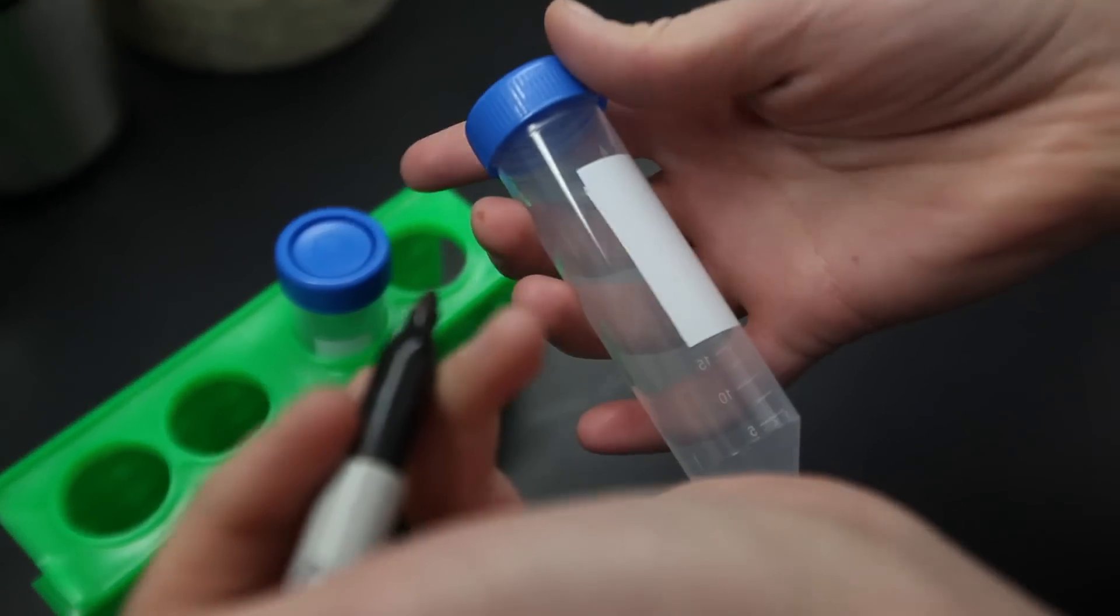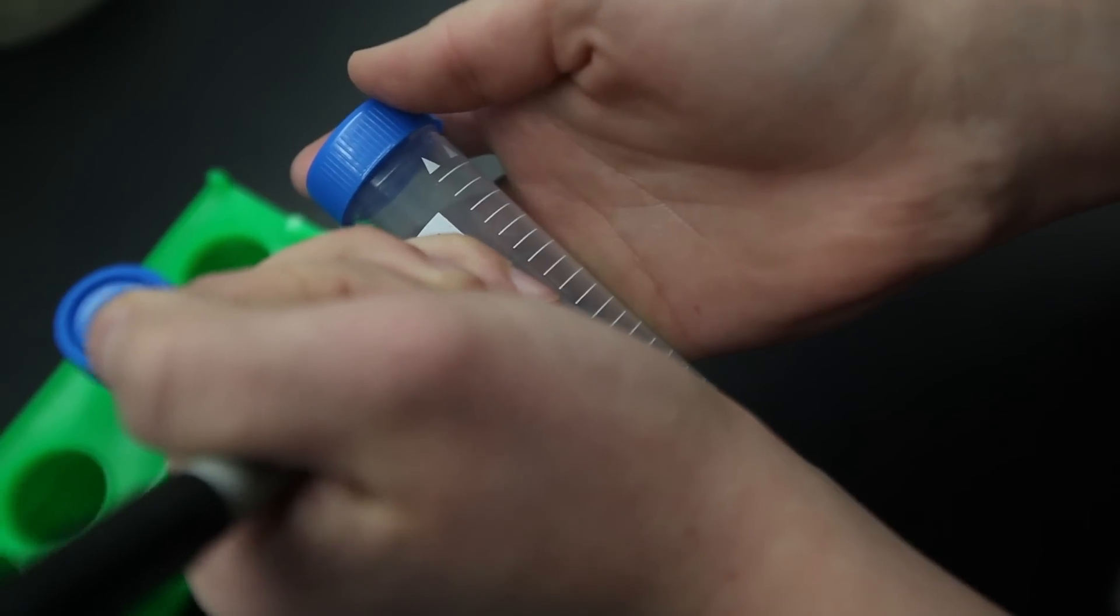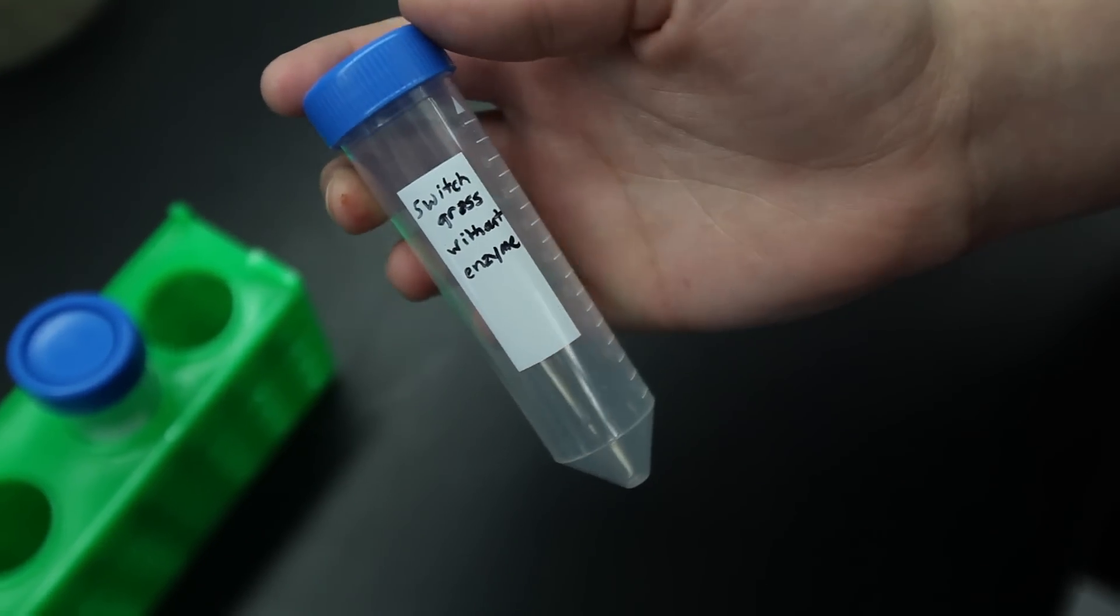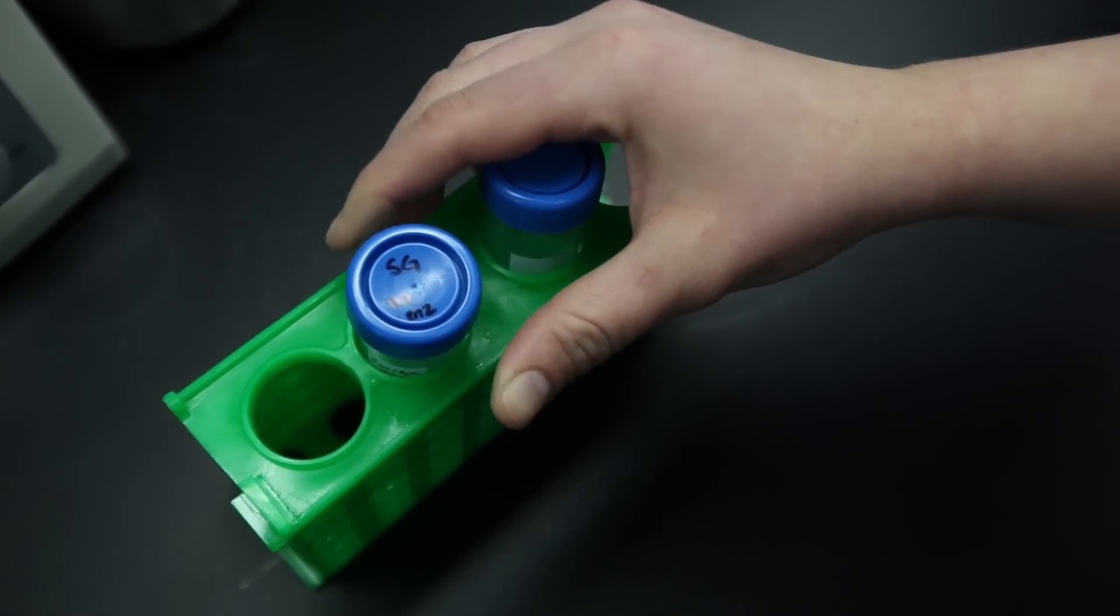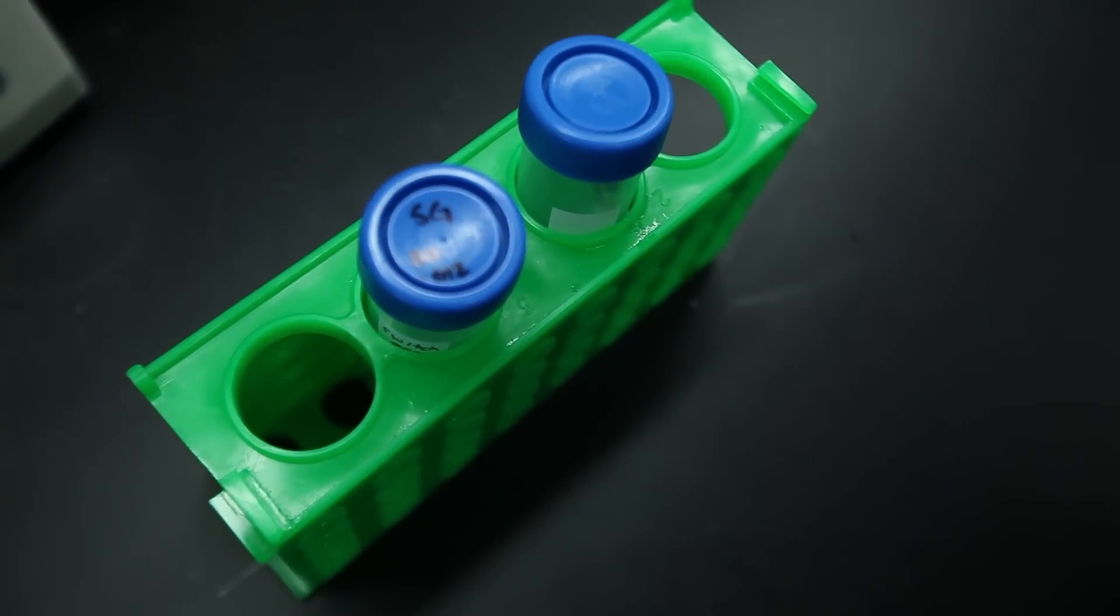When you have your samples sufficiently ground, you can prepare the test tubes. Before you put anything inside, it is first essential to label each tube with the biomass and pre-treatment information. Indicate this both on the tube and the cap.